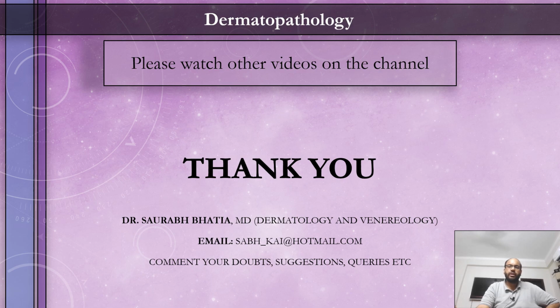You will not understand if you look on the internet, because on the internet you will see textbook prototypic slides. You need to know how normal slides look, and you need to get adjusted to the act of actually viewing the slides in a microscope using both of your eyes, using different magnifications, using different foci or levels of slides, how to set a stage, how to actually use the oil immersion. Know everything about it, and you will gradually understand all of this. The pinkish and bluish hues will slowly start to make a little bit of sense, and then you just keep on looking at slides and keep on learning new and new things. So without much further ado, we'll finish this lecture.